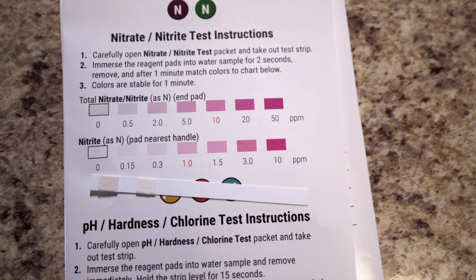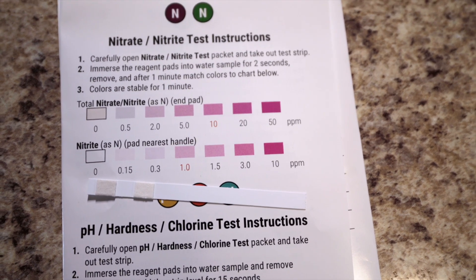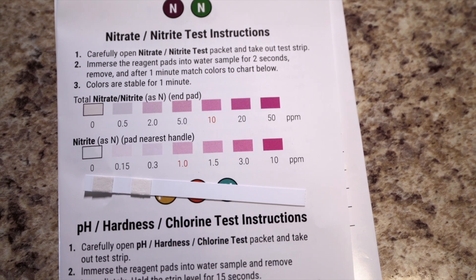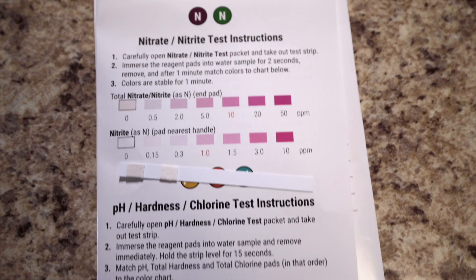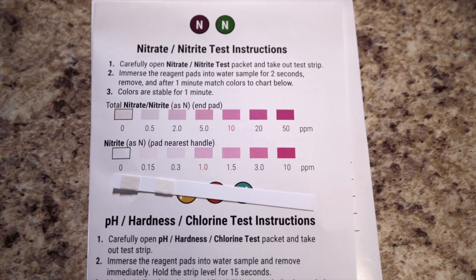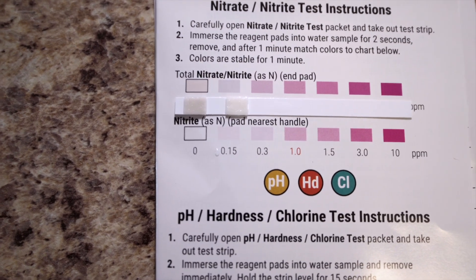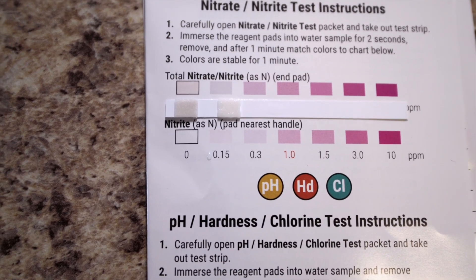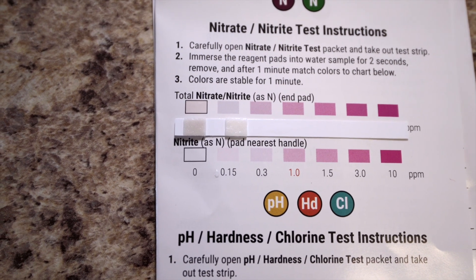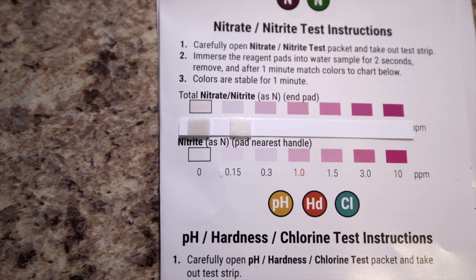The next test is the nitrates and nitrite test. You can see it's a double pad on this test strip. Again, we're just going to dip it in and match it up to the chart — this one goes quicker, only about a minute. Results show zero nitrates and zero nitrites. The pad closest to the end matches the top chart, and the pad on the right matches the bottom chart.